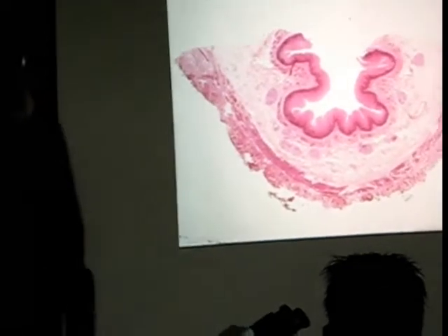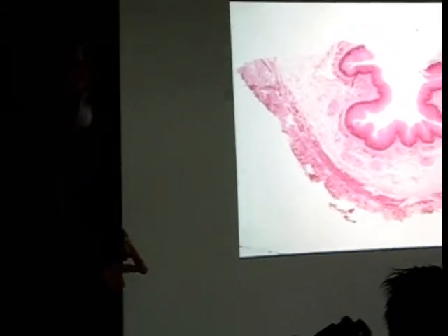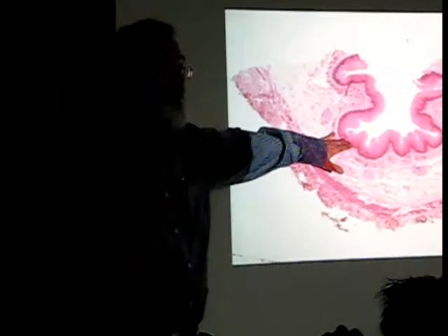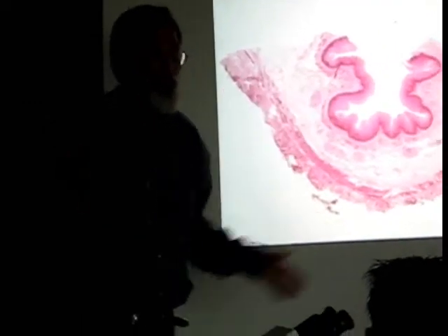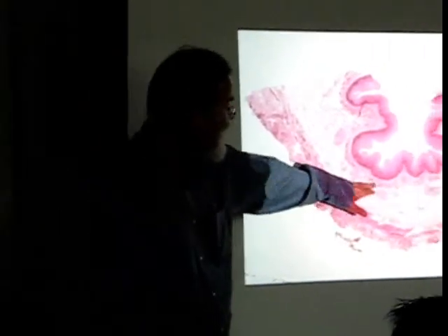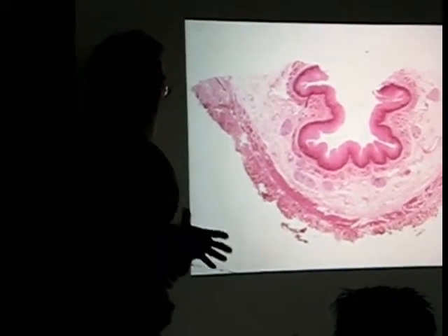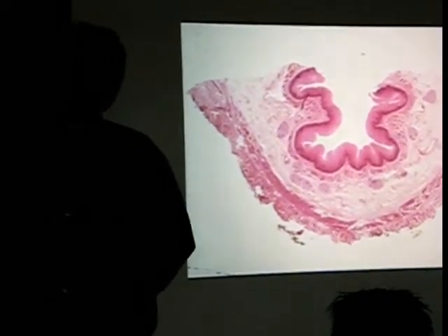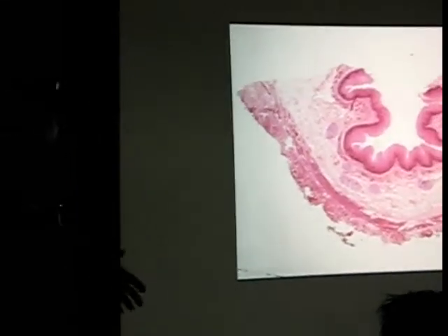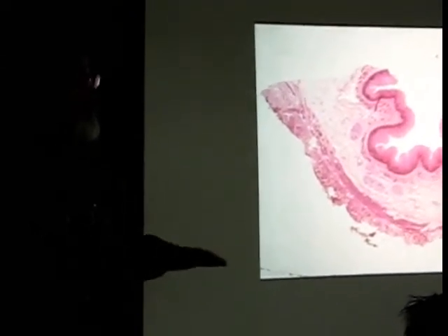Now that's going to be a very important thing to remember when we get to the female reproductive system. Because if you think about the vagina, it's got the same type of epithelium, right? Stratified squamous non-keratinized. You find that where there are frictional stresses. But it doesn't have the muscularis mucosa. And again, you should begin to be thinking about potential lookalikes, and I want to direct you to that website, the histology lookalikes that a medical student helped us put together. And the sooner you get on that, the better off you're going to be.